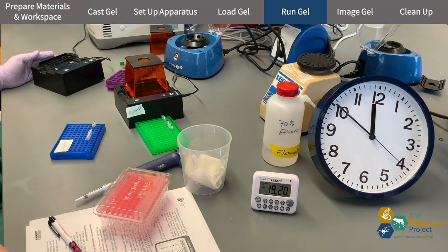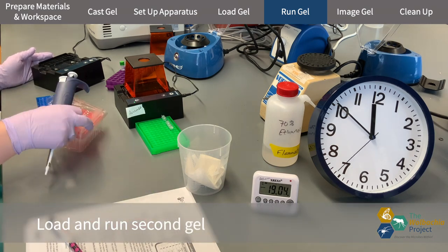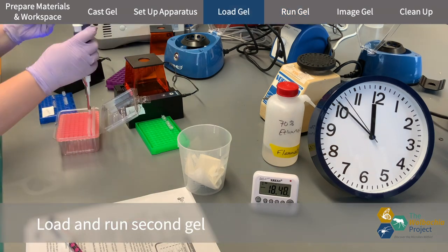I'm setting up both the Arthropod and Wolbachia gel in parallel, so they will both be running at the same time.